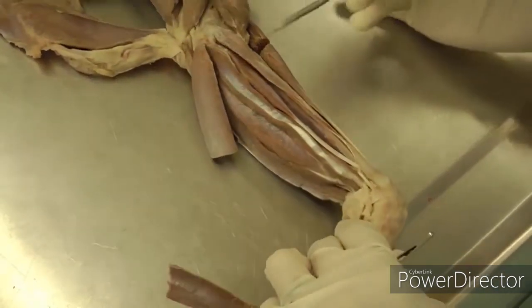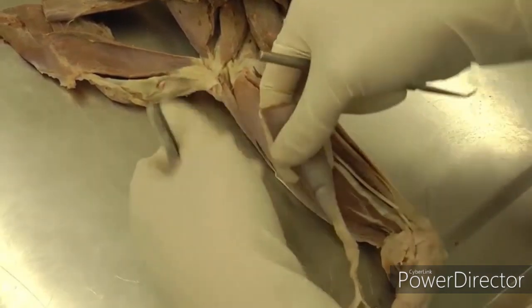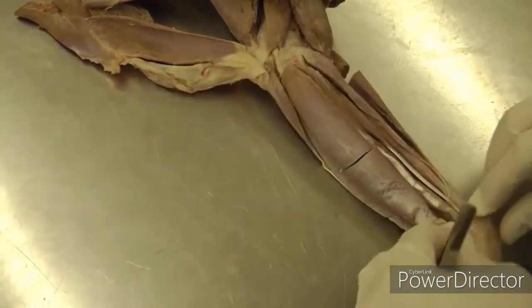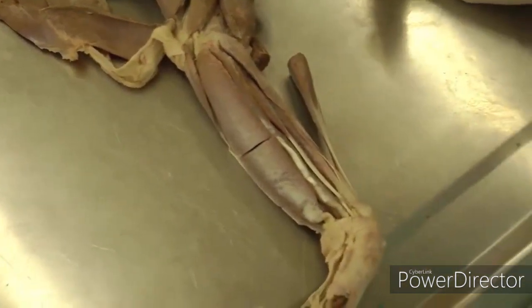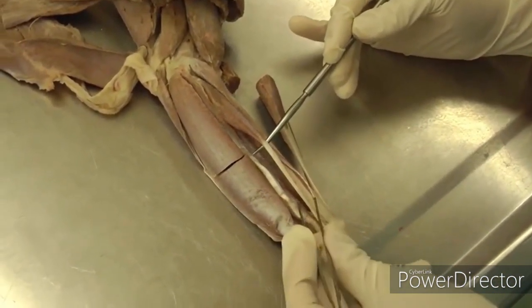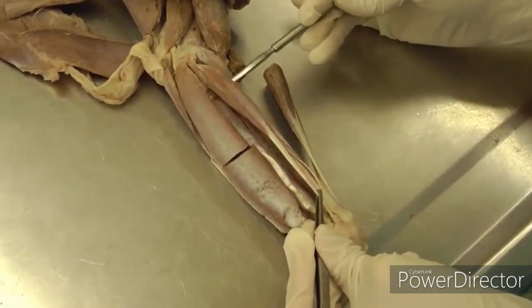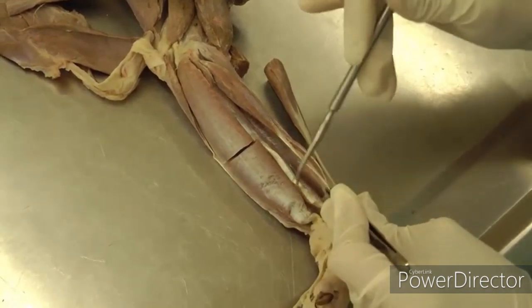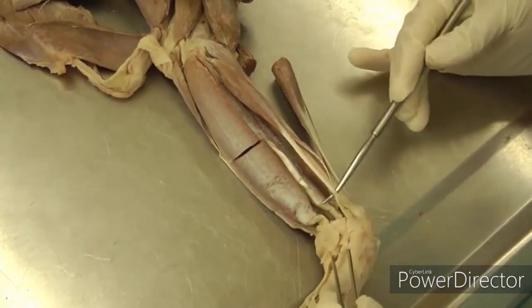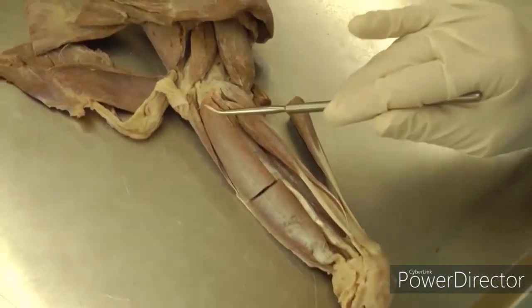Now we'll move to the flexor muscle group. We will start with the flexor carpi radialis muscle, which is this small muscle right here — kind of small compared to the other flexors back here. That's flexor carpi radialis, and it's just caudal to pronator teres.